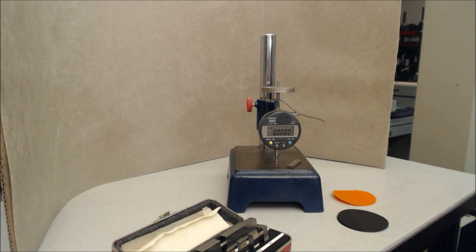We're here at GSI demonstrating ASTM D5199 for smooth thickness of geomembranes. Please realize there are three procedures within the standard, and we're running Procedure B.